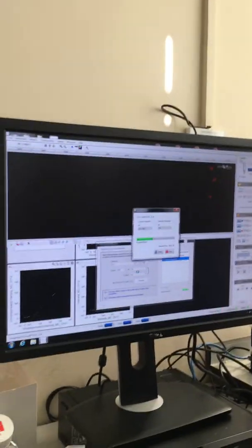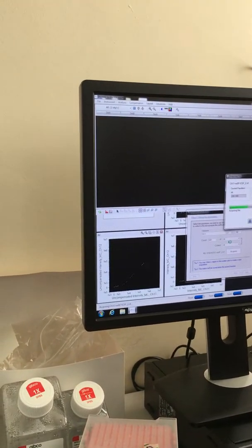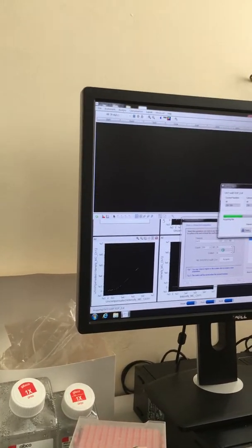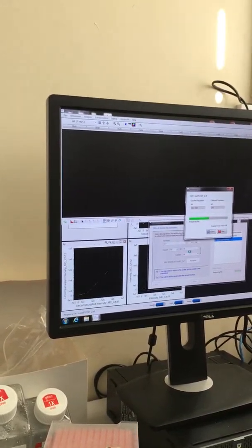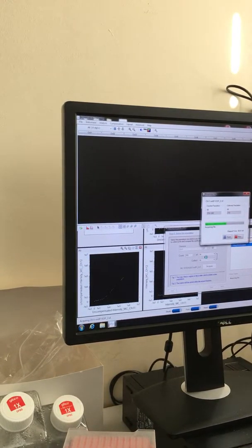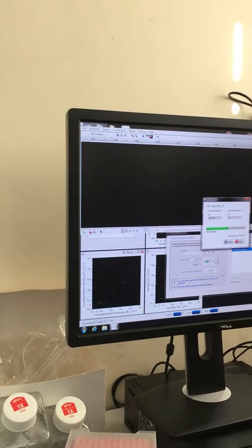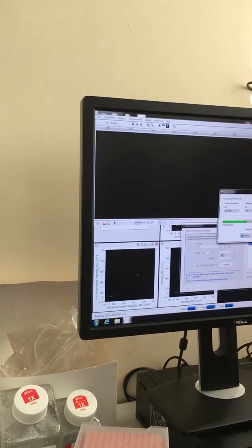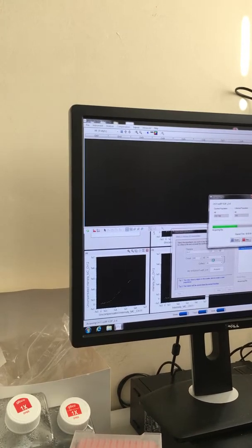So even with the samples, 500? I would try and count way more. But the problem is it's going to take longer, right? It's a balance between having a good histogram and the time that you have. The default that we do is 10,000 events for acquiring your sample. I'm pretty sure I do 10,000. So you want a decent number of events when you record your sample.